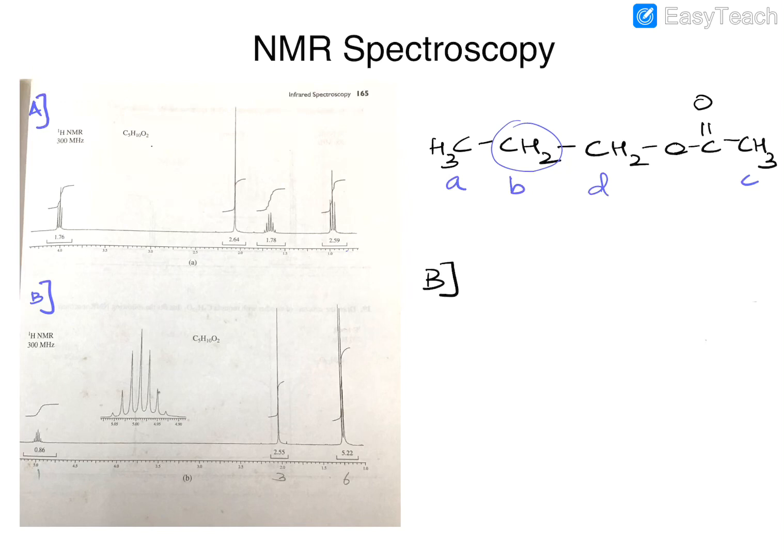The structure of the molecule finally comes to this. And you see that the molecular formula in each of these cases is exactly the same, but their NMR spectra are considerably different from one another, and these NMR spectra will then help us in elucidating which of the 2 structures is correct for the ester at hand.